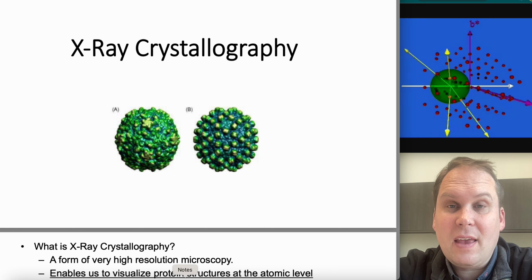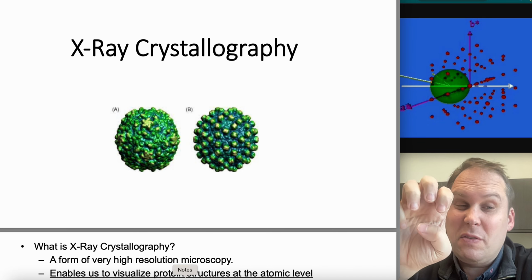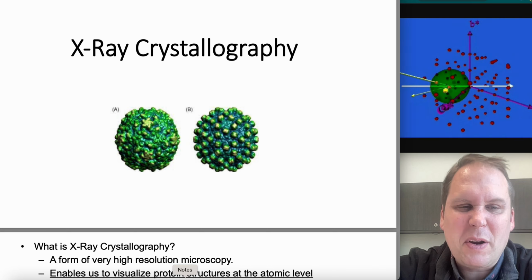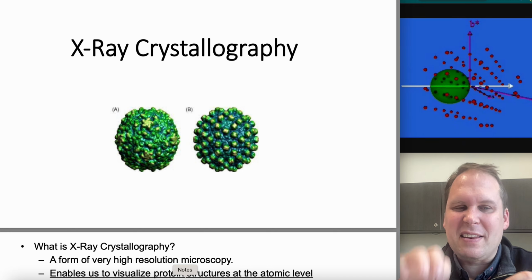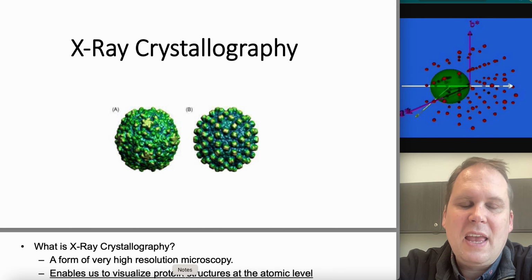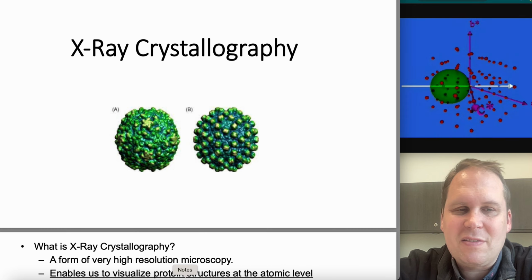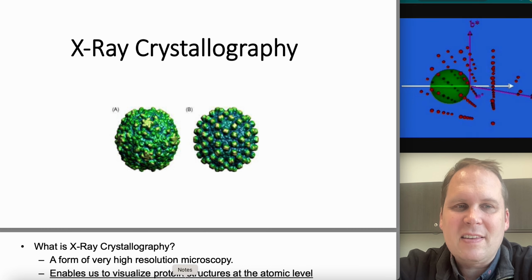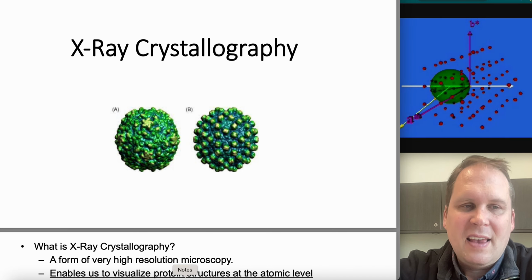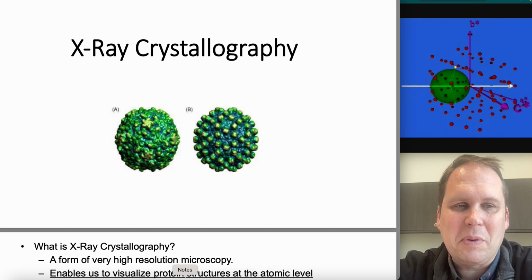But the neat thing with X-ray crystallography is that it gives you one static view of the crystal, usually a dried out version of the protein. It's like looking at a mummy and trying to imagine what the person was like. You have to rehydrate it and imagine it moving around a little bit. NMR will give you a range of structures. They'll normally bundle together the 10 most likely structures, with the best evidence, and show the protein as it's moving around, doing different things. Those are quite interesting when you can get one, when it's amenable.